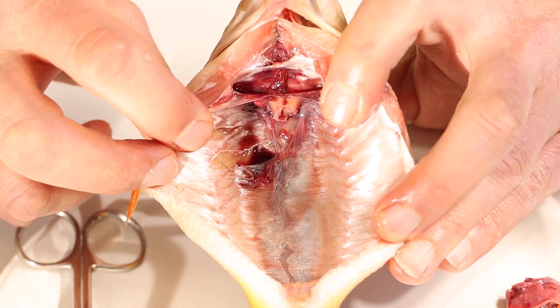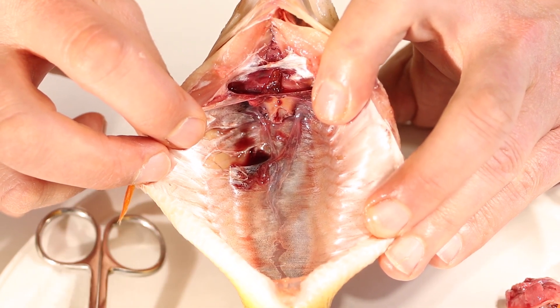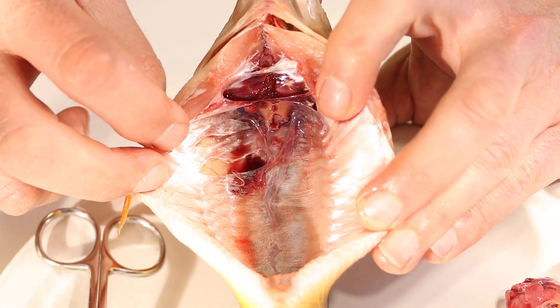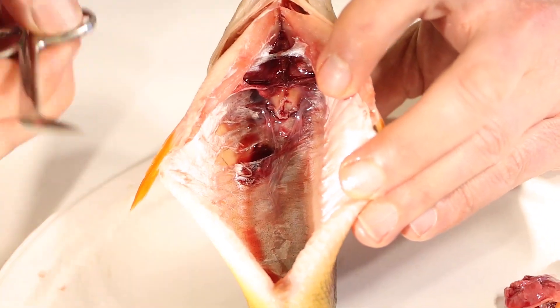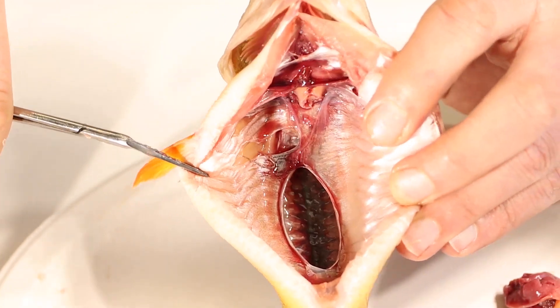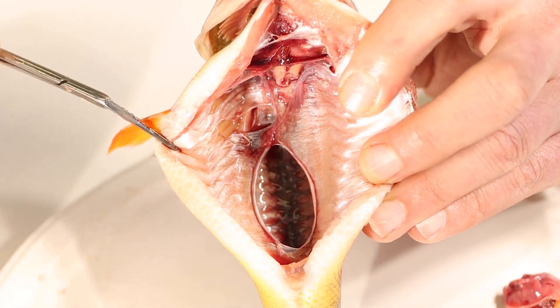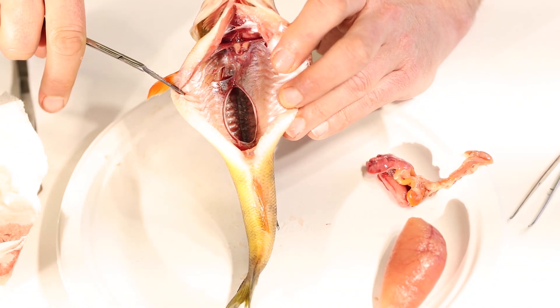What would you guess is inside an air bladder? Air — right? Makes sense. Why would a fish want air inside its body? Because air floats in water. The air bladder, if we pop through it, is just a hollow tube — it kind of deflates now, but you can see it was a hollow tube full of air. That helps the fish float in the water. Without an air bladder, a fish would just sink right to the bottom like a big rock.